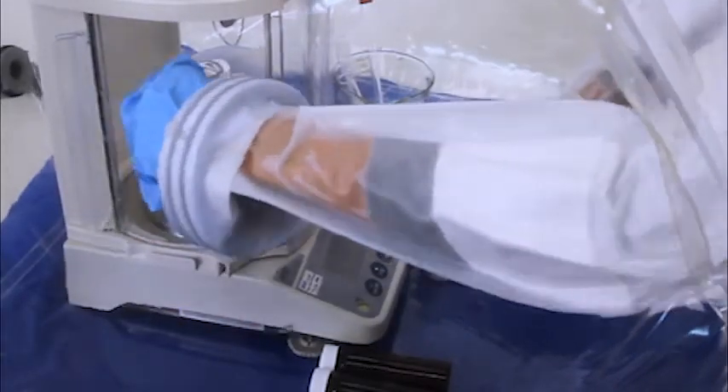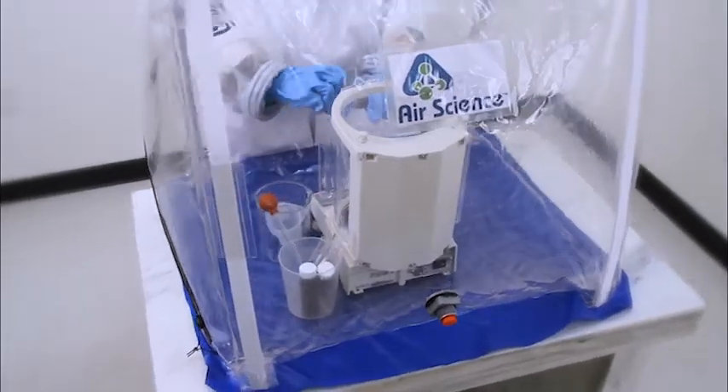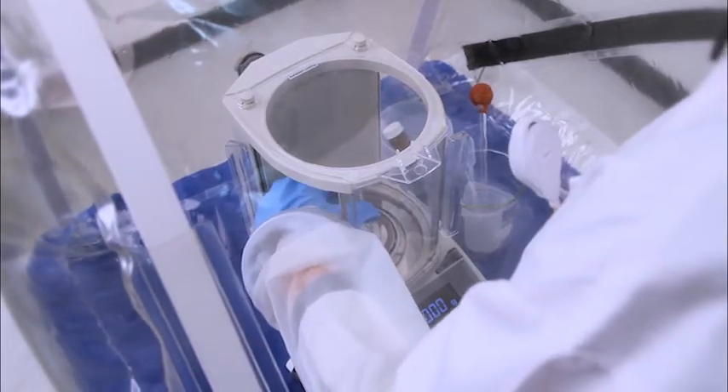The HRA delivers performance and economy in three key areas: space, effort, and the budget. If this situation looks familiar, you know that space can be an issue in the lab. The HRA is especially effective in the tight confines of fume hoods and glove boxes. With its rotary doors, the HRA needs no extra space to open the doors.